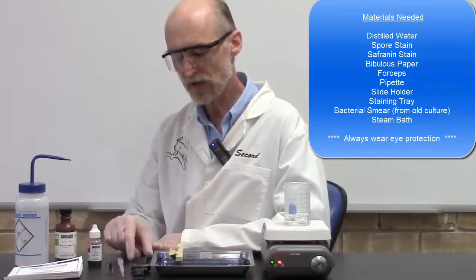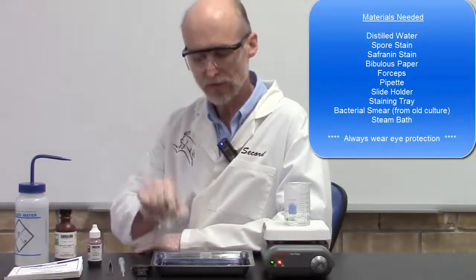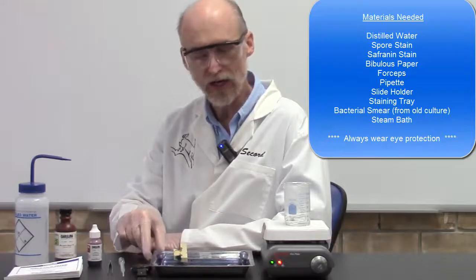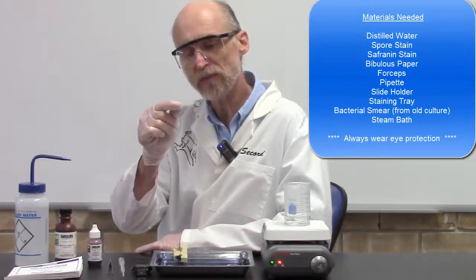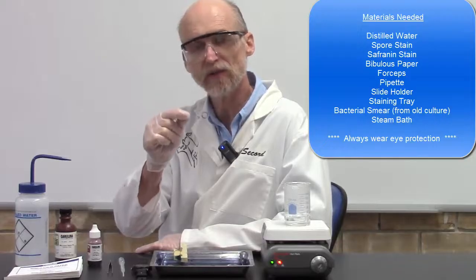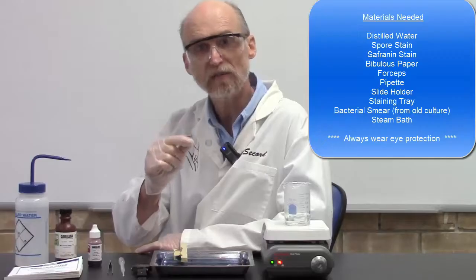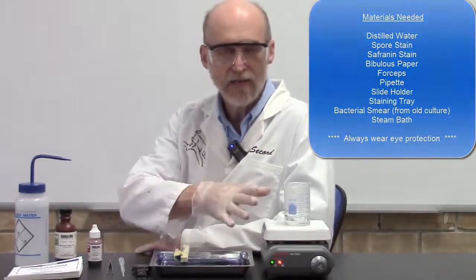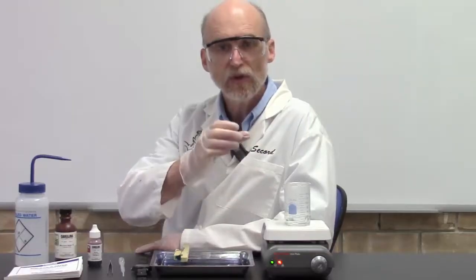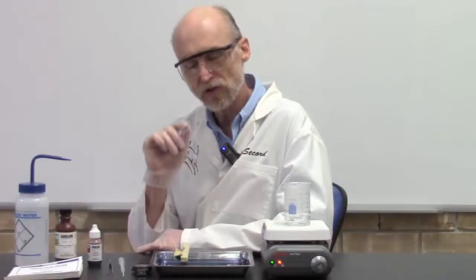A pipette to apply your spore stain, some way of keeping track of time, a slide holder, a staining tray, and a bacterial smear. Make sure the bacterial smear is from a bacterial culture that is at least 48 hours old because you need to give the bacteria time to sporulate. And finally, a steam bath, which we use to drive the spore stain into the spores.